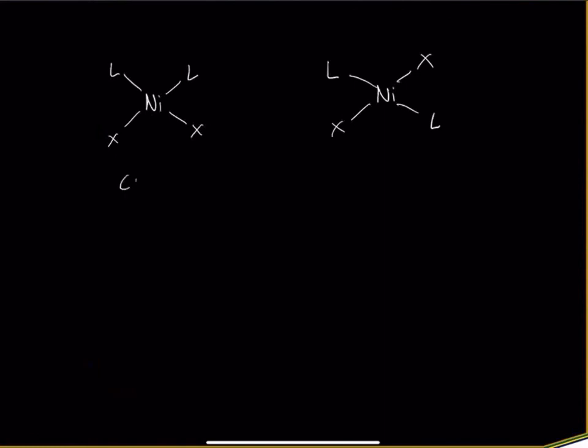So we have our cis and our trans isomers. And the second thing that you're going to be looking at for this experiment is trying to make a guess as to whether you can even determine the difference between cis or trans with the information that's given. And we're going to actually be using vibrational spectroscopy to try to answer this question.